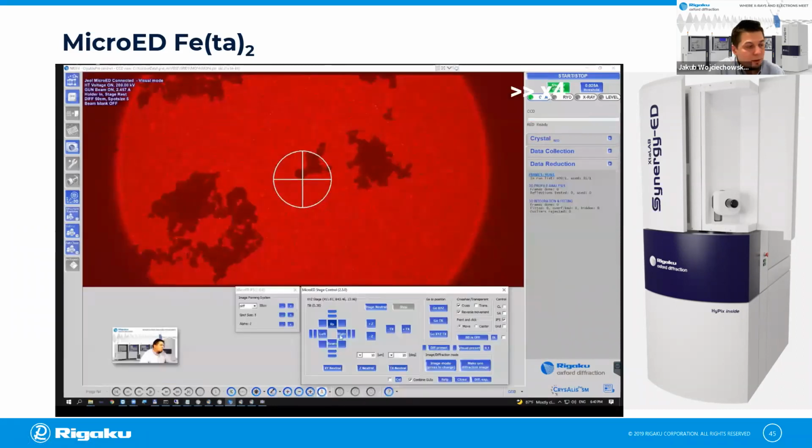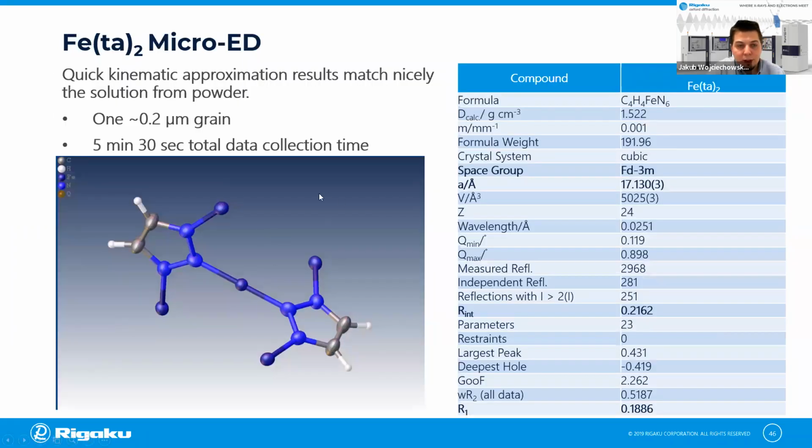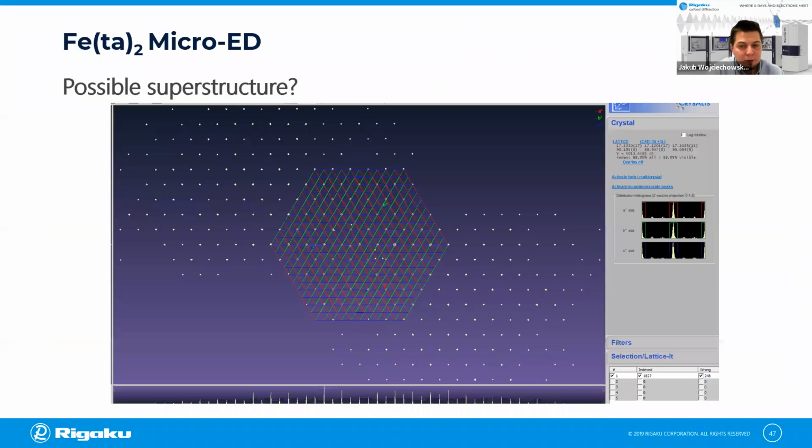And then those are the results. This is of course a kinematic approximation using OLEX and CrysAlis Pro 2, but it was not bad. We're still discussing the coordination distance because the two distances are slightly different. We still have to check that. But I also found something interesting.